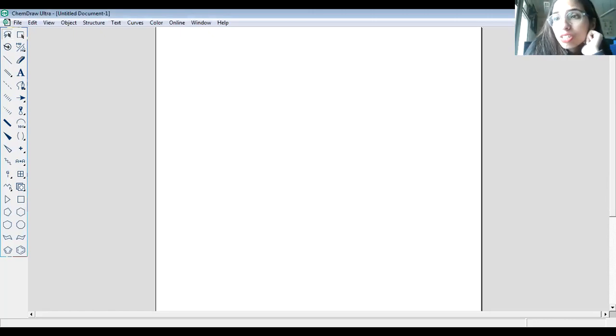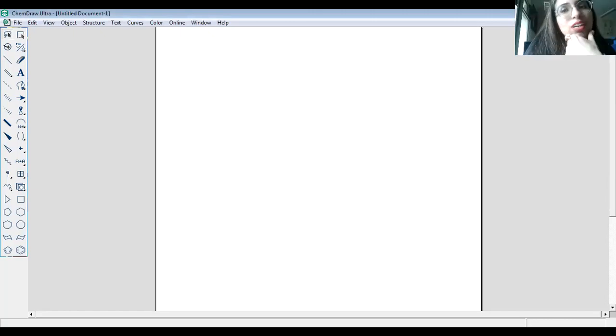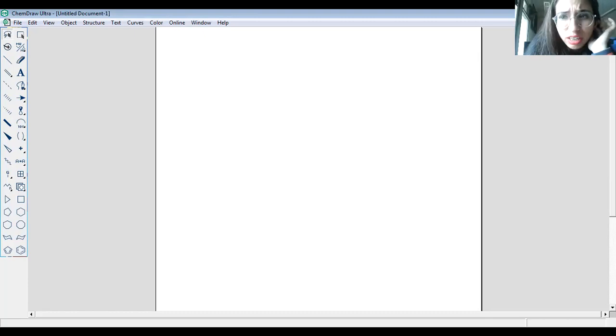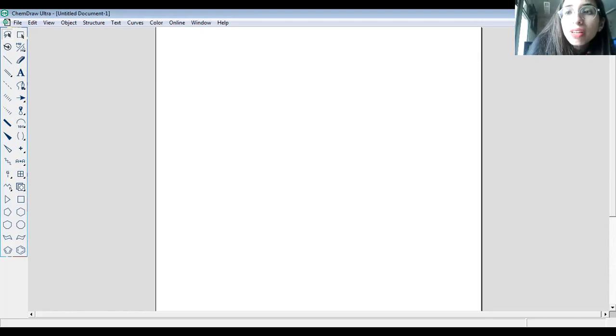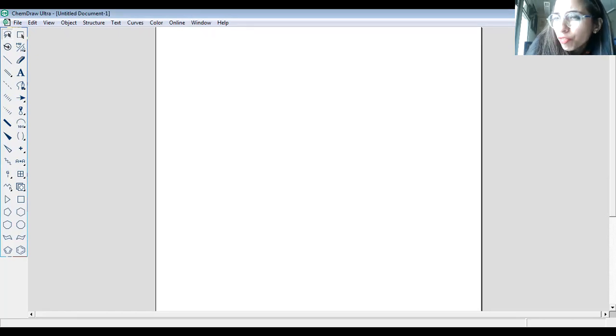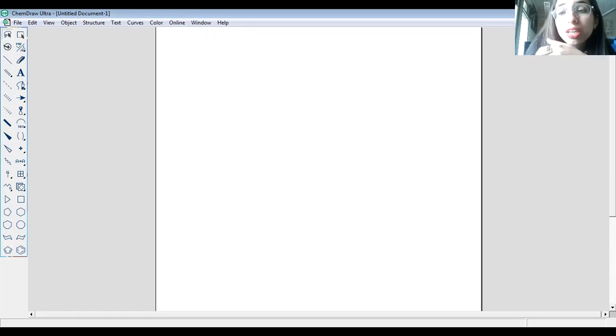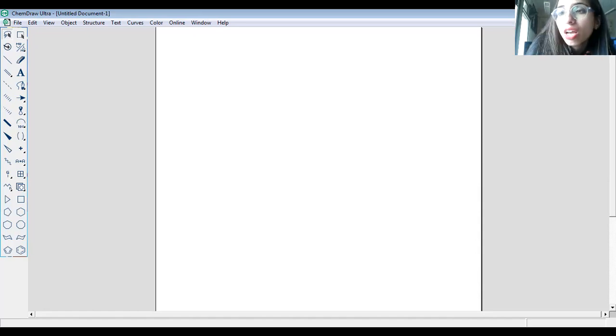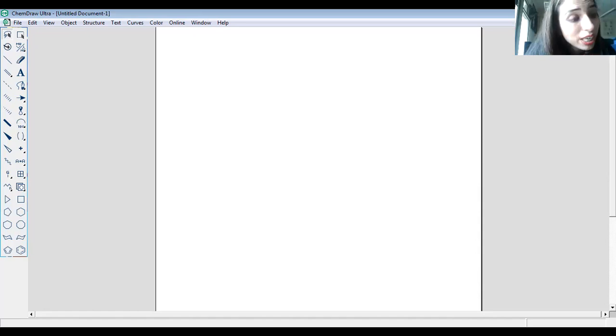Today I'll tell you the basics of ChemDraw. What is all about this 2D and 3D structure? I think you people learn about this from different examiners. If you're basically in chemistry, this question everyone asks: what is the difference between 2D and 3D?